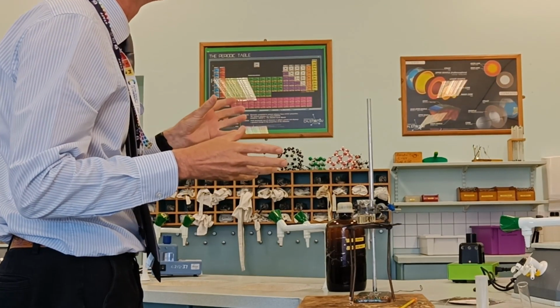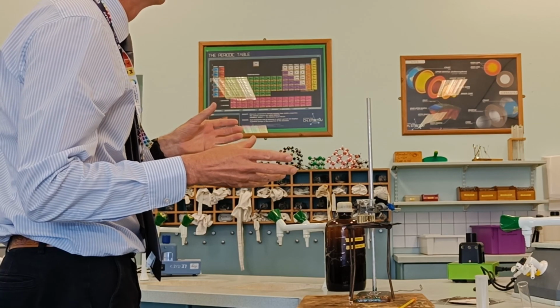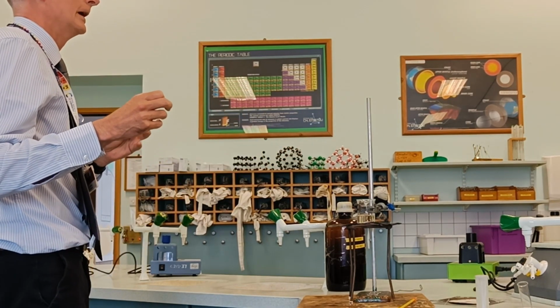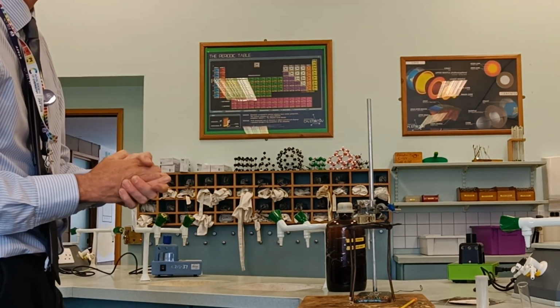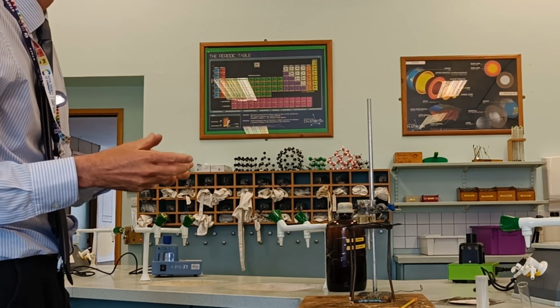Now you've looked up the melting point of benzoic acid, and it's 122 degrees. So what I'm going to do is heat up my sample to 122. If the melting point was less than 100, I could heat it up with some water. But the melting point is more than 100.